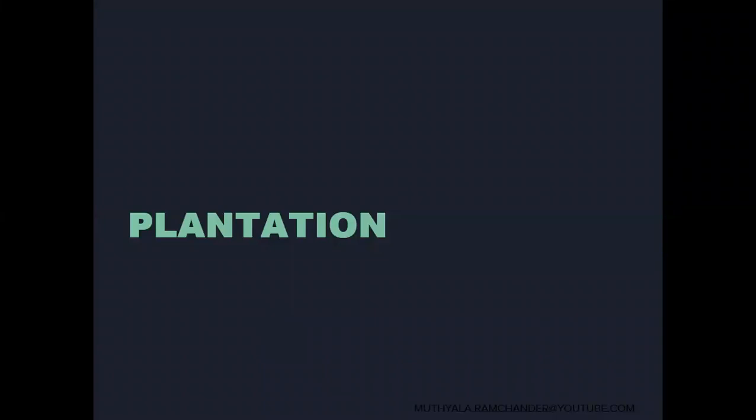After this, the plantlets are comfortable for the outer environment. Finally, the modified plantlets are planted in the outer environment. The plantlets develop into virus-free plants, quality food-producing plants, identical to the parental plants. These are the benefits of the tissue culture procedure.